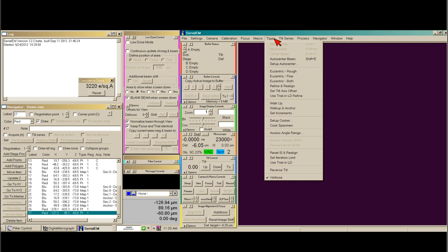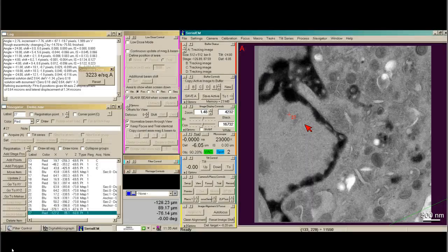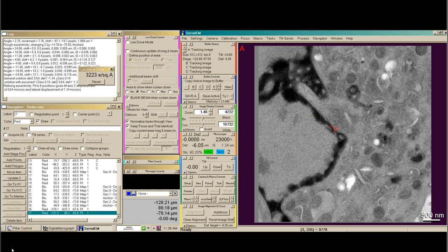What I need to do next is eucentricity, so I'm going to do both rough and fine. Eucentricity is finished, and I see that I have a lateral displacement that's bigger than one micron away from zero. This lateral displacement is a measurement of the distance of the optical axis from the tilt axis. We can correct for that in SerialEM by going to Tasks, Set Tilt Axis Offset, Accept the Value, say OK.